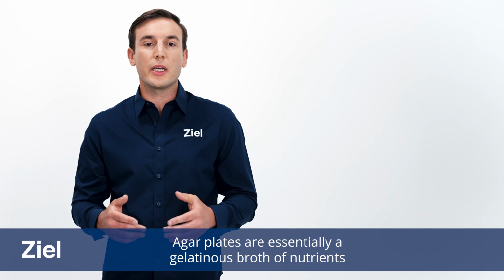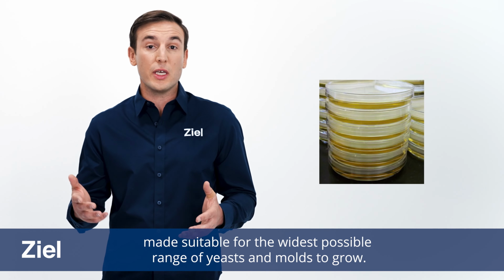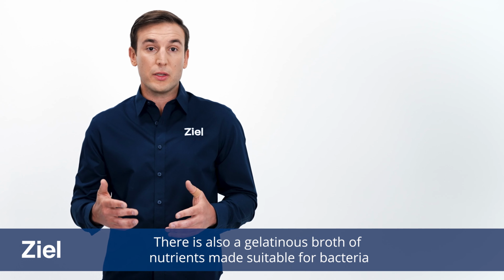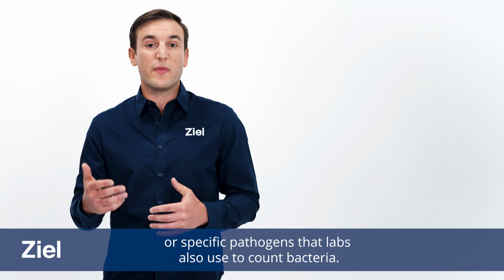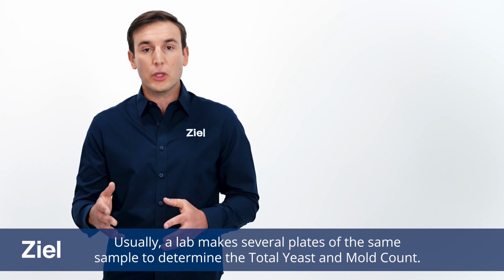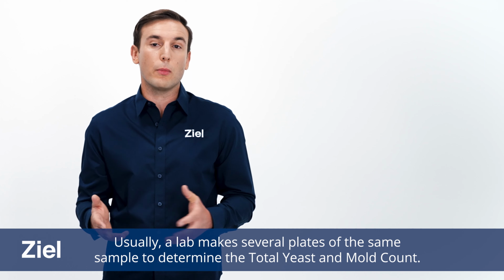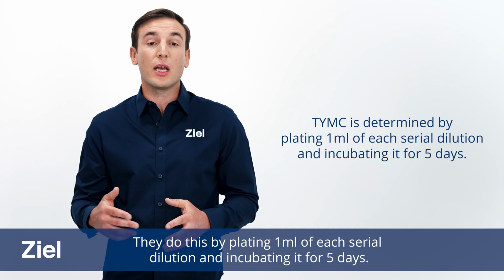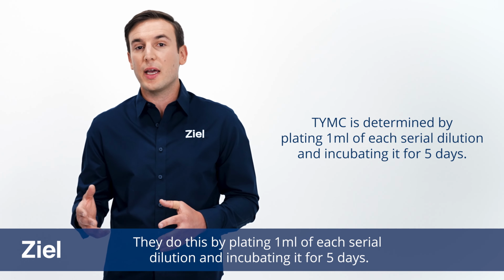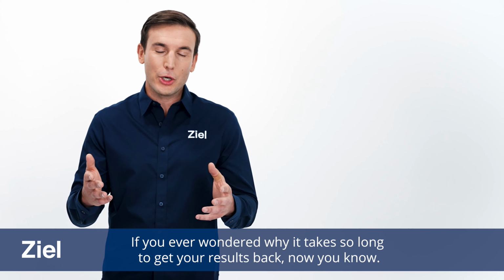Agar plates are essentially a gelatinous broth of nutrients made suitable for the widest possible range of yeasts and molds to grow. There's also a gelatinous broth of nutrients made suitable for bacteria or specific pathogens that labs also use to count bacteria. Usually, a lab makes several plates of the same sample to determine the total yeast and mold count. They do this by plating 1 milliliter of each serial dilution and incubating it for 5 days. If you ever wondered why it takes so long to get your results back, now you know.